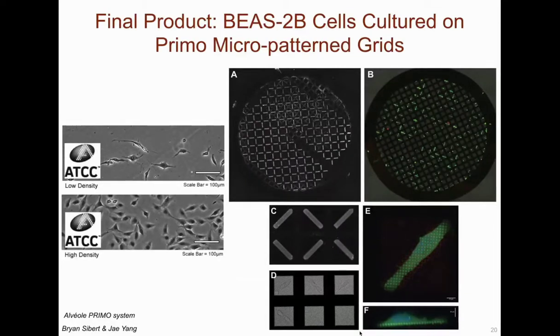Second, to orient the cells and have them spread over the central region of an EM grid square. The line pattern supports an even and regular distribution of the cells across the entire EM grid without cell clumping or disruption of the underlying EM grid structure. Furthermore, with extended regions of the cell periphery, we would have greater opportunity for locating and imaging regions of virus entry and attachment or virus assembly.